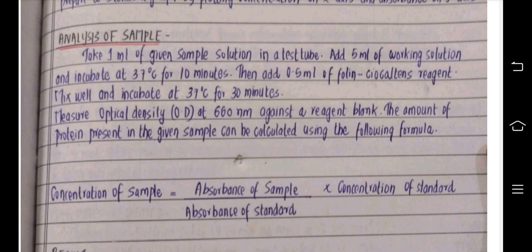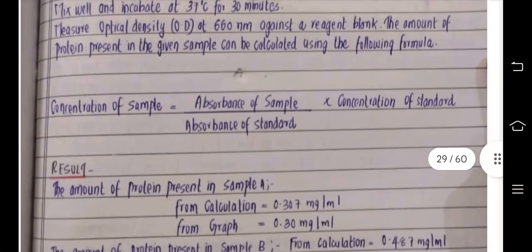The amount of protein present in the given sample can be calculated using the following formula. Concentration of sample is equal to absorbance of sample by absorbance of standard into concentration of standard.